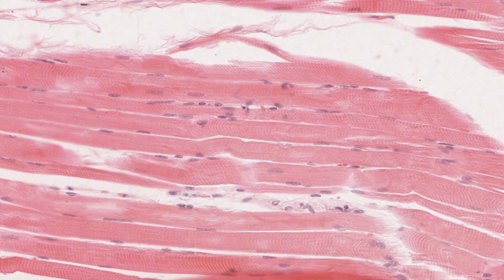And again, note the number of nuclei on this fibre sectioned longitudinally. Some are slightly out of focus because they're below the focal plane and perhaps on the other side of the cylindrical shaped muscle fibre. A small proportion of these nuclei adjacent to the fibre just under the external lamina that I'll describe later are satellite cells.